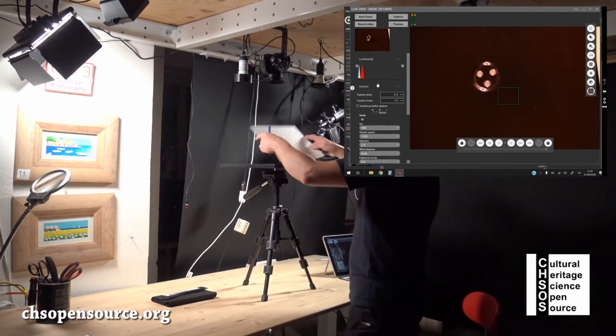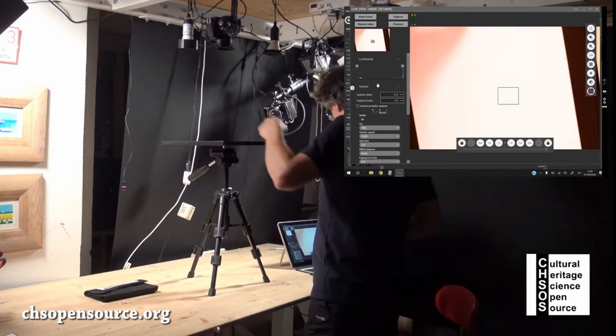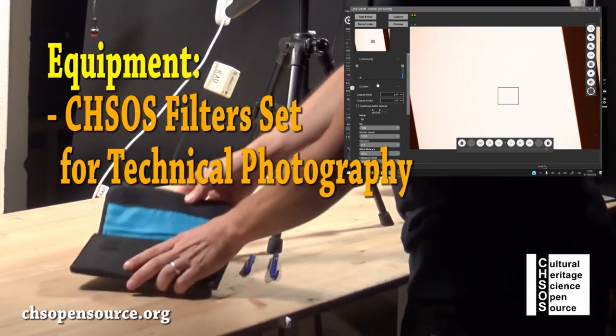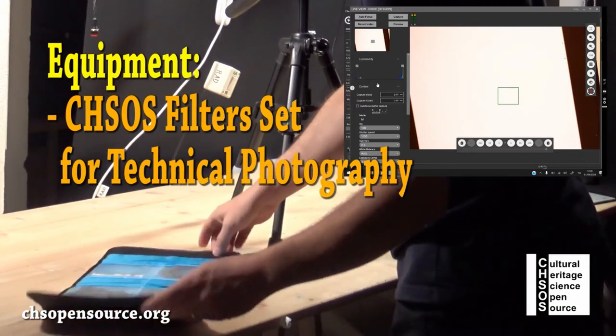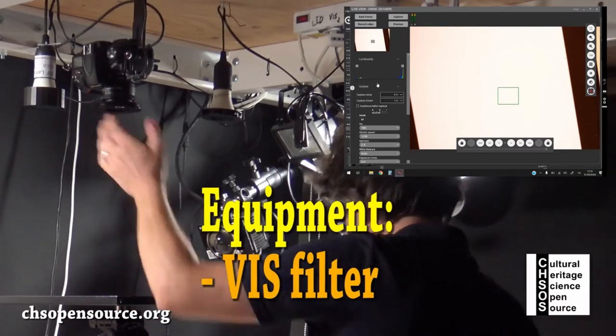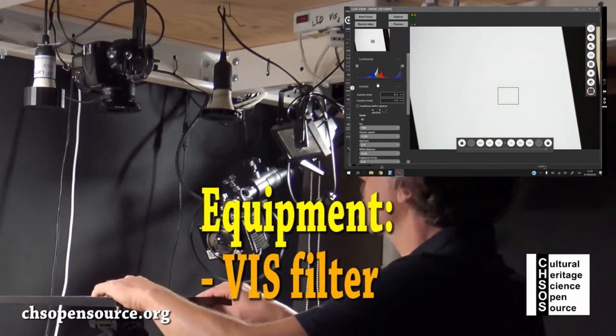On this sheet of paper, we will test two different blue pens. For this experiment, we will use our filter set for technical photography. We first use the VIS filter on the camera to have a standard visible range photo.